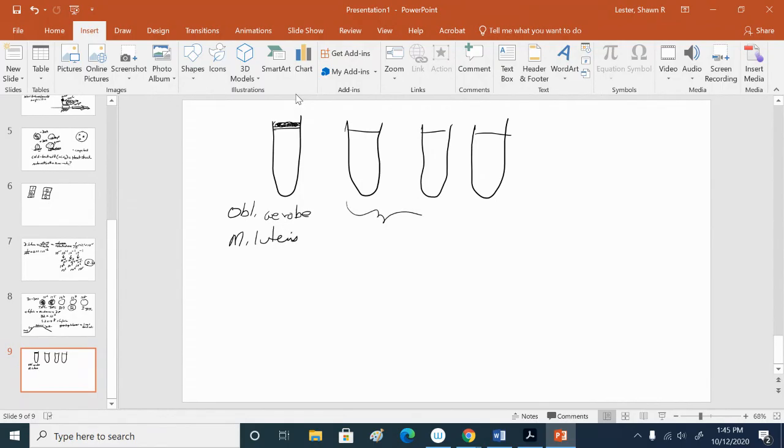And then we had two other organisms which showed the same result. Great growth on top, but also growth all throughout the agar. And so they showed us that they loved oxygen but did not need it. So what do you call those kinds of organisms?